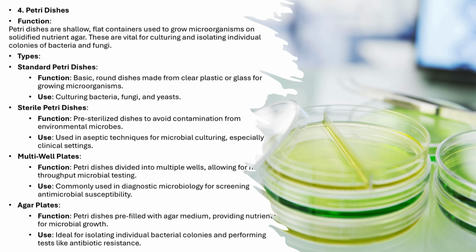Now, let's talk about one of the most essential tools in microbiology, the Petri dish. These shallow, flat containers are used to grow microorganisms on a solidified nutrient medium, often agar. Petri dishes are vital for culturing, isolating, and studying individual colonies of bacteria, fungi, and yeast. Whether you're working in a research lab or clinical setting, Petri dishes are a staple of microbiological work.